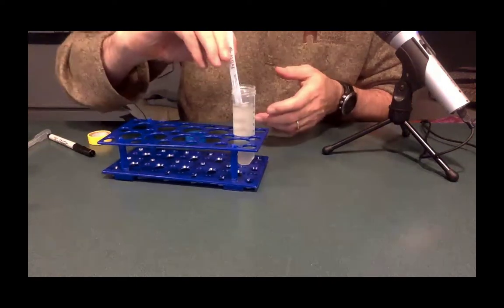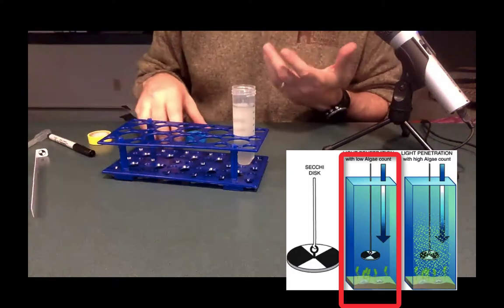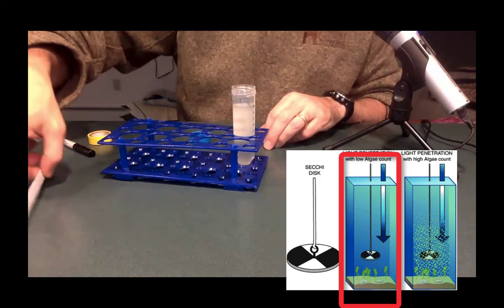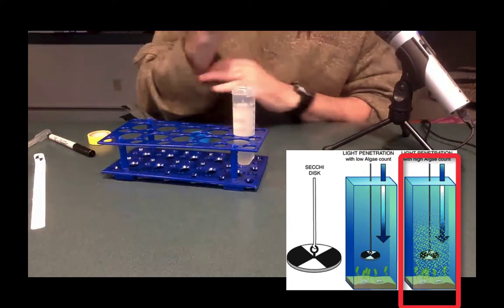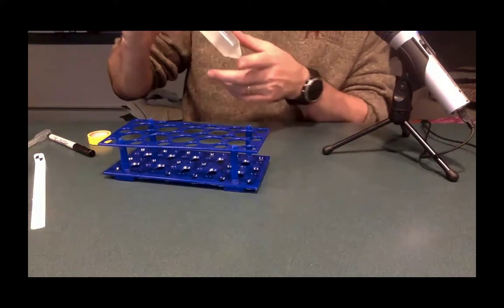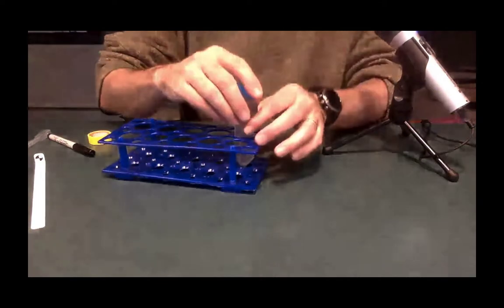Now, the idea here is that if this solution is clearer, meaning there's less algae, I should be able to lower this down further. If it is more algae, I'm not going to be able to drop it down quite as far. Now, the important thing is that I'm going to set this up and let it settle. So the next time I come and do my reading, likely some of the algae will settle down to the bottom. So I'm going to always want to shake it up before I do my reading.